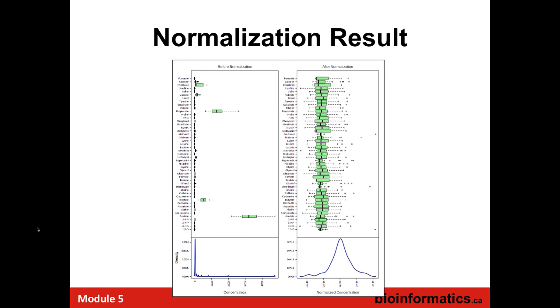So everything's lined up on the left, and then there's a few way off to the right. So by using the scaling functions, by doing both row and column normalization and centering, we've now changed the data. So instead of looking really skewed, it looks like a bell curve. It's Gaussian. And it's now plotted in the same box plot to the right. And you can see everything is sort of, it's visible, unlike the one on the left. They have a range. There's a standard deviation. You can see the quartile sets. And when you plot out the entire distribution, which is shown at the bottom, you can see this bell shape curve.